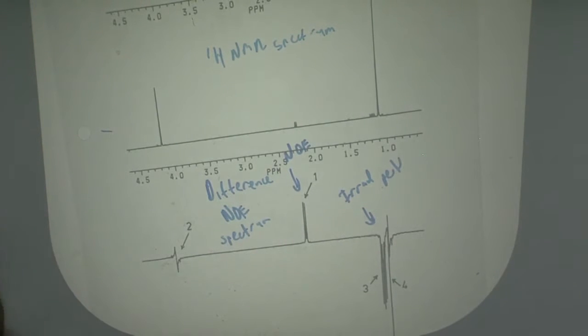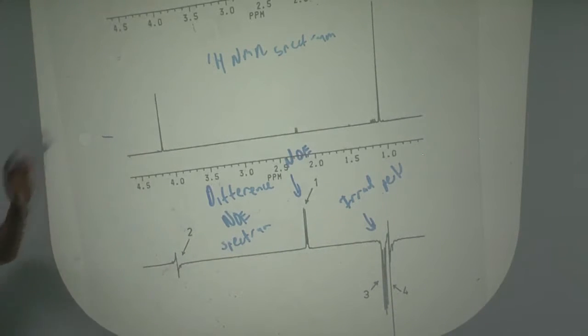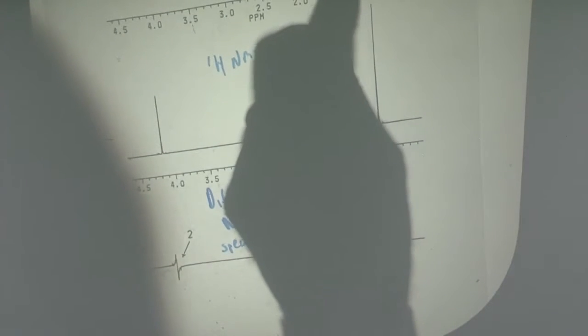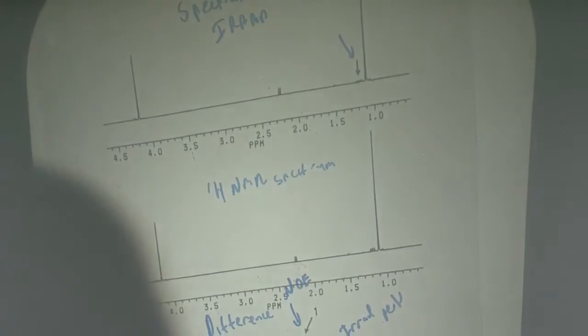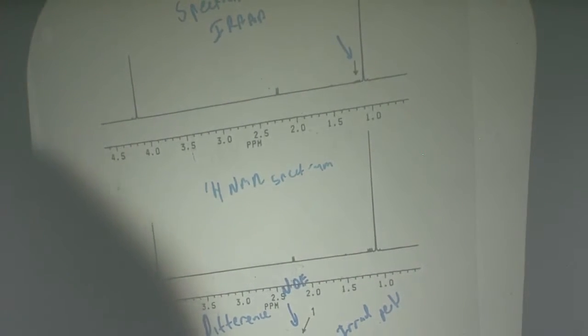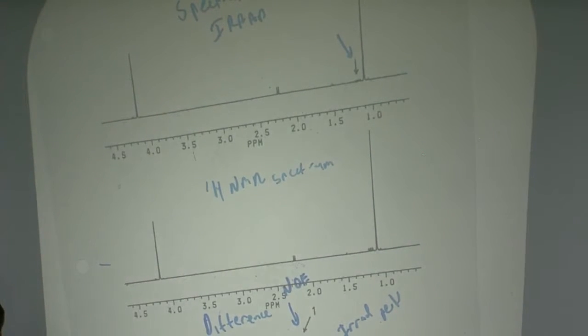Now, one of the things about the traditional NOE experiment is the conditions of doing the irradiation create little perturbations in the spectrum. And actually, to do it right, what you do is you do one spectrum where you irradiate here, in this case about 1.15 ppm. And this one, in order to minimize the subtraction artifacts, you actually go ahead and irradiate somewhere else, off where nothing is, like over here or over here. But even with that, there are small perturbations.